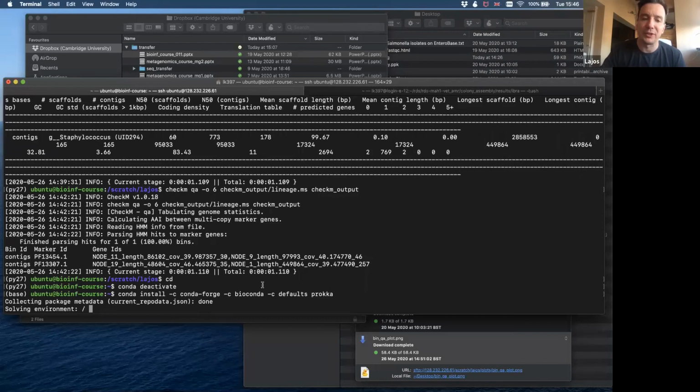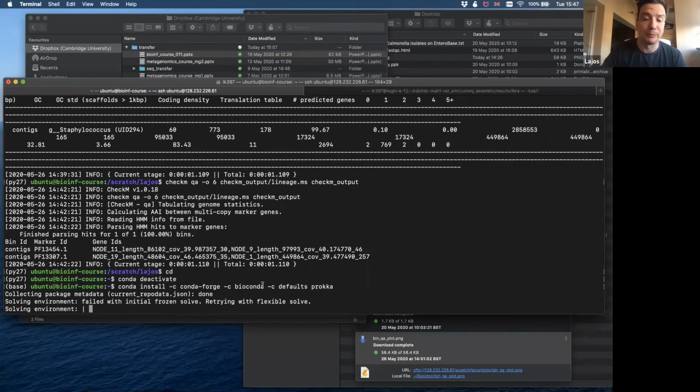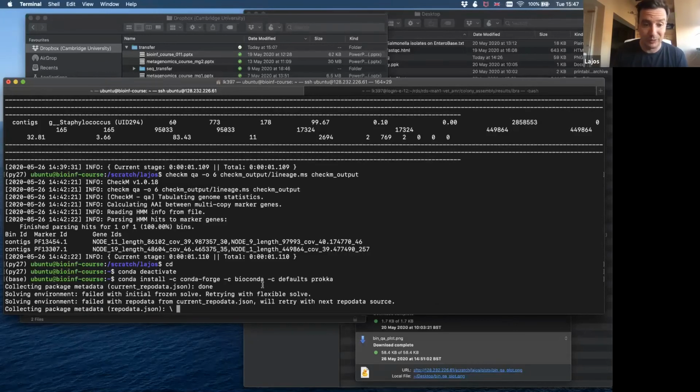So the 2 main reasons you want to do genome annotation, and again, this is prokaryotic genome annotation. This is very important. I am not the good person to teach you eukaryotic genome annotation. That's much more complicated. I saw a few papers and I read about that, and it looked very, very difficult many times.